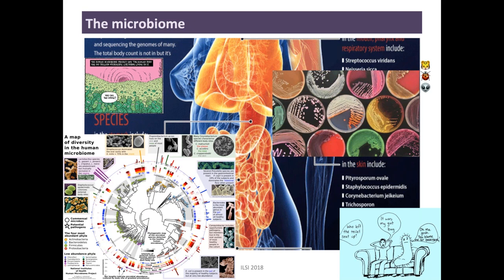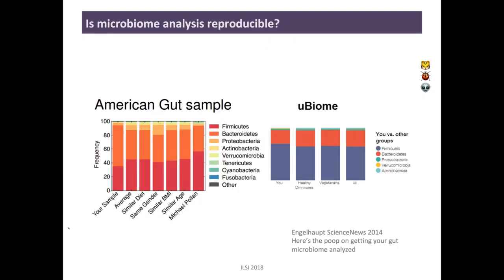I'm going to start off by talking about problems with microbiome analysis. The first question is: is microbiome analysis reproducible? I'm going to argue that as currently constituted, it's not particularly reproducible. This is a famous example where journalists sent the same gut sample — the same stool sample — to American Gut and to uBiome, and basically got back completely different answers. The relative composition of their stool sample was very different. This became the rationale to start working on reproducible methodologies, including the Microbiome Quality Control Consortium, of which I participated.